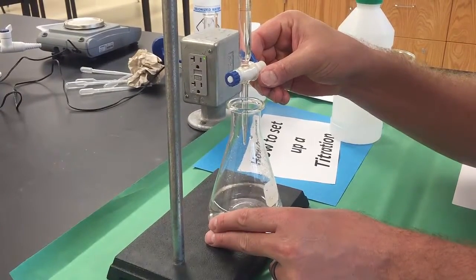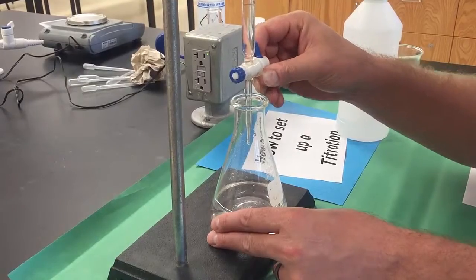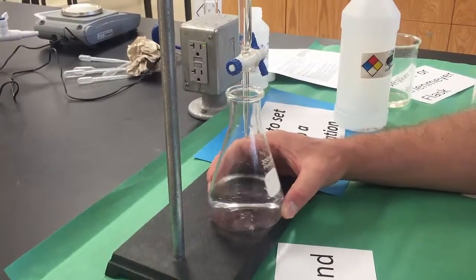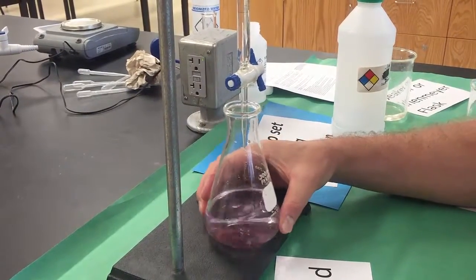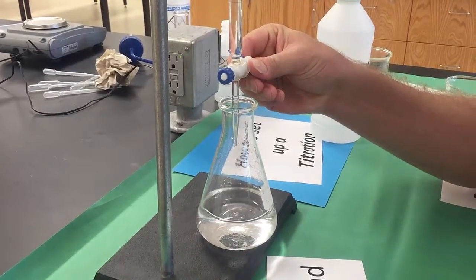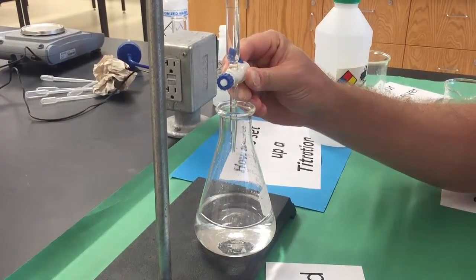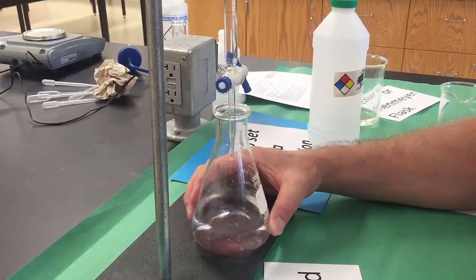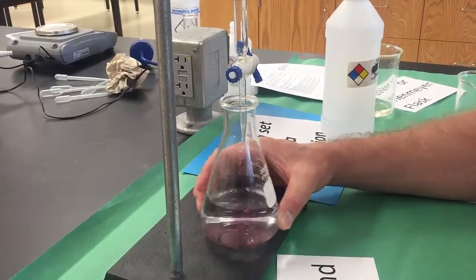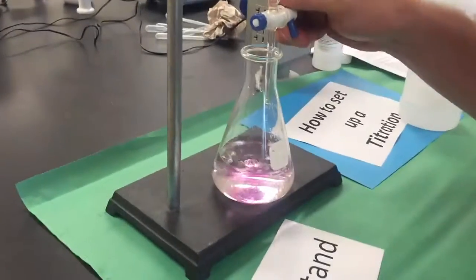But we need to come up with a technique that gets us there, and we want it to turn pink with the addition of one drop. So the closer you get, the slower you need to go. I may not be that close yet, so I'm going to go a weak stream here, but you notice it stays pink longer, so I know I'm close. Again, you'll have a lab partner here, so one will be swirling, the other will slowly be turning, and we can get this to go really slow to the point where we know when it's about to turn. So we're getting there. It's staying pink longer with each additional drop. And we're just about there.